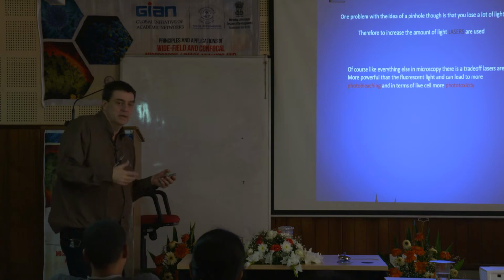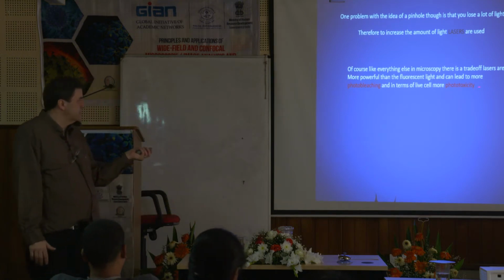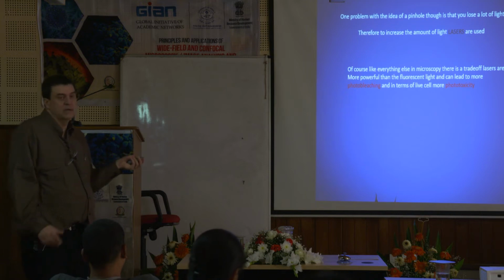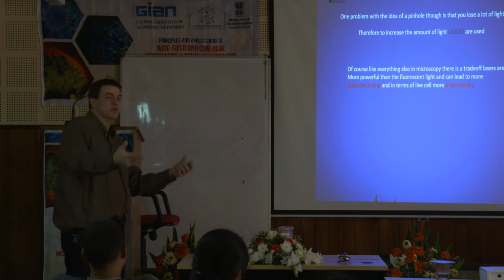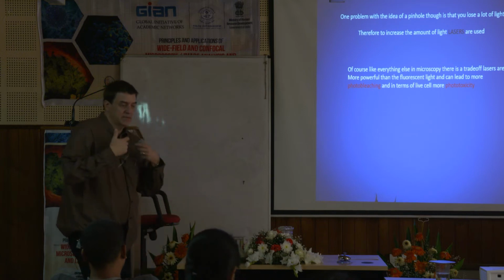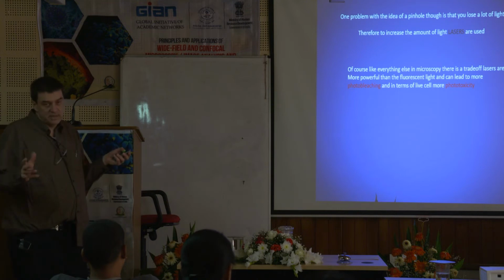I mean, you are basically sunburning them, okay? And that's what phototoxicity means. Photo, light; toxic, poison. You are light poisoning those cells. So a laser, being a stronger light, tends to hurt those cells much quicker, tends to cause that burning much quicker, okay? So it's something you got to be careful with.